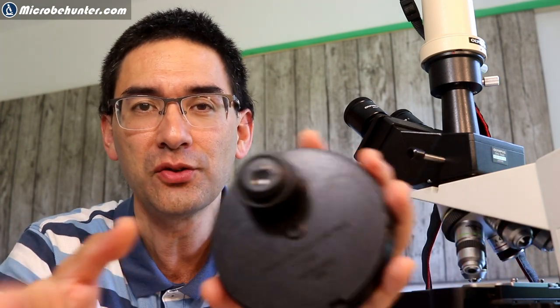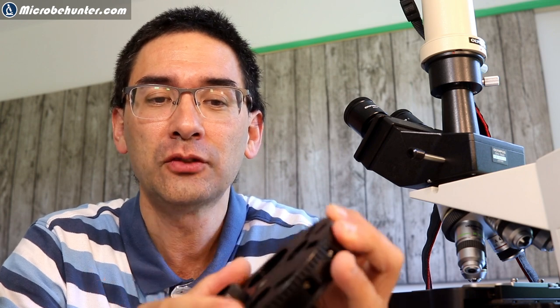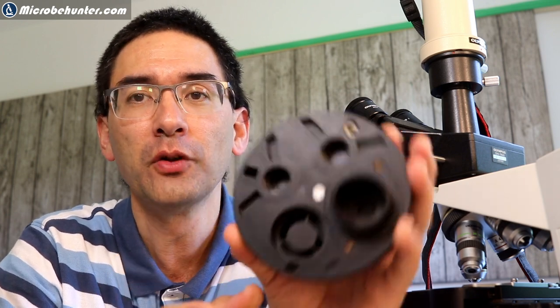What I'm going to do in this video is the following. I'm going to show you now the same pictures using bright field and also phase contrast so that you can see the difference. And also later on, for those of you who don't know what phase contrast microscopy is, I'm also going to give you a very short description and right now also a short description of this condenser here.